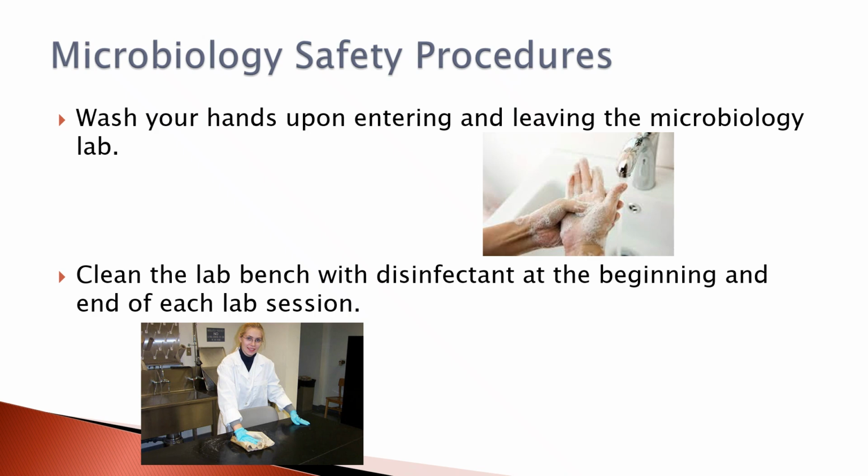Some other things to know: we wash our hands when we enter and when we leave the microbiology lab. This was always a source of great frustration to my students if they needed to leave when I was still teaching on campus, to go to the restroom or anything like that, because you had to completely disassemble yourself, take off all of your PPE, and wash your hands to leave, and then you had to wash your hands when you came back. Even if you just washed your hands in the bathroom, you have to wash your hands and assemble all of your PPE. So I used to always say, make sure you pee before you go to class, because leaving is kind of a big ordeal.